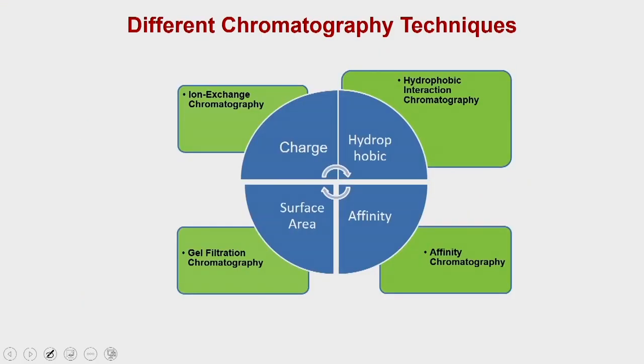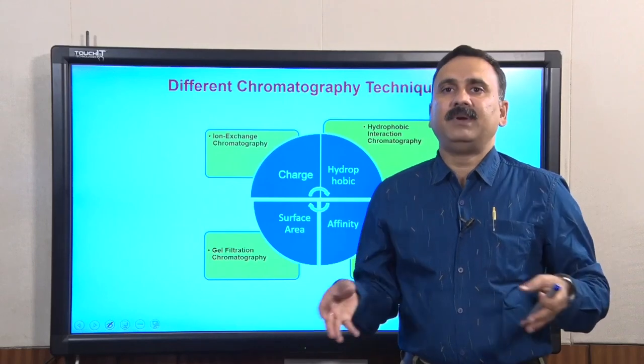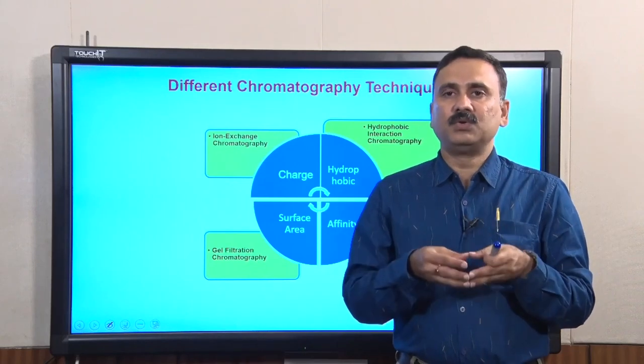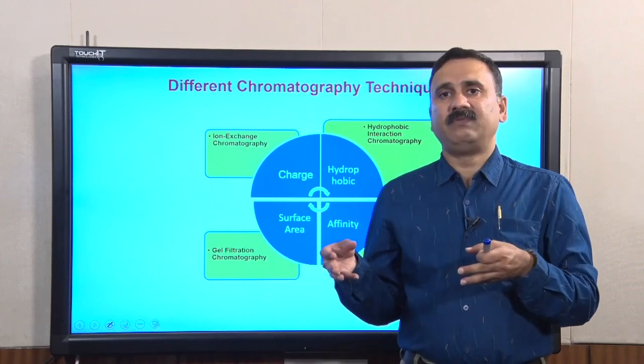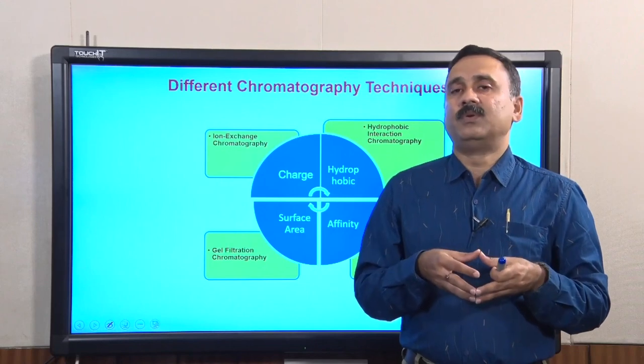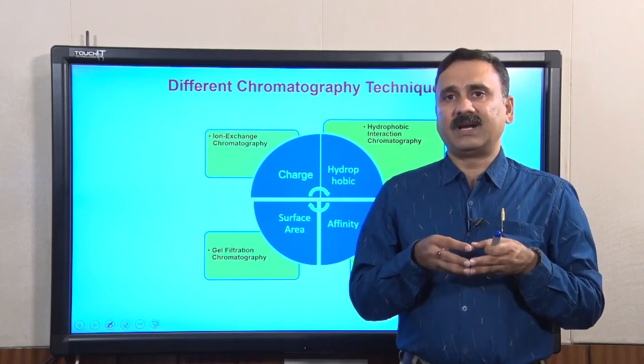So this is all about the different chromatography techniques which you can use to purify factors from cells overexpressing your protein or other metabolites. Now let's recap and summarize, and understand how you can exploit these different chromatography techniques to perform protein purification or purification of your factors.